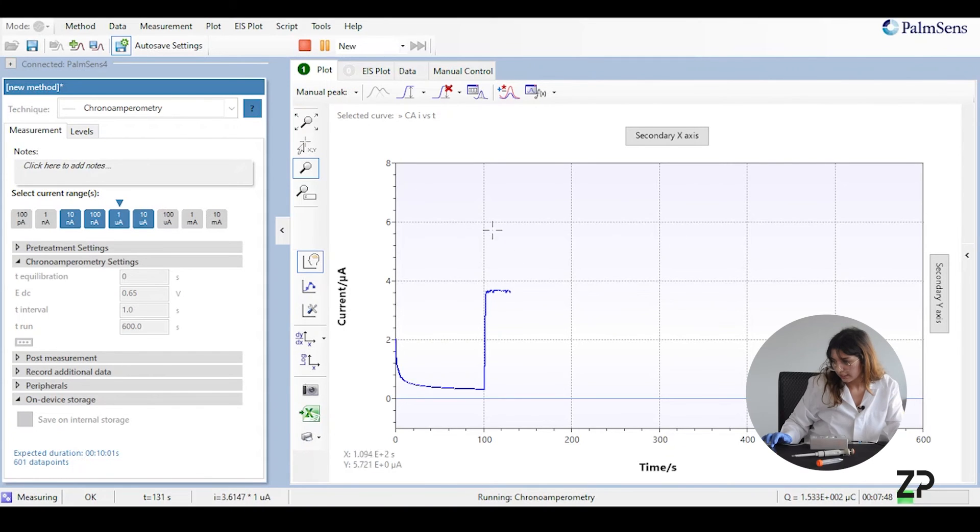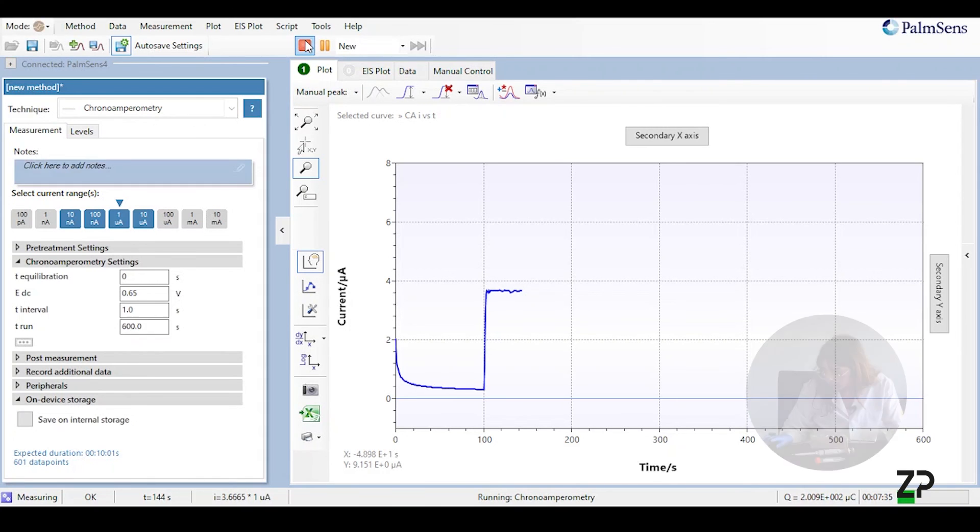There's a spike and now it's stabilizing — the experiment is now complete, so I'll press stop. Thank you very much for watching, and if you have any inquiries you can visit our website and get in contact with us. Bye.